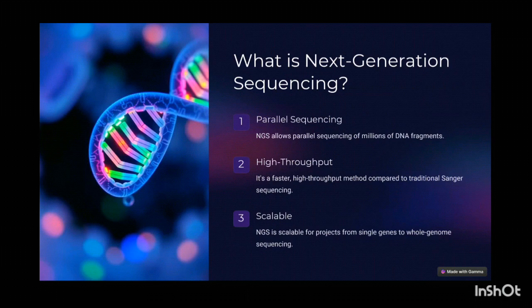This dramatically speeds up the process and allows you to finish the puzzle in a fraction of the time. The process of NGS starts with breaking down the DNA into smaller fragments. These fragments are then tagged with adapter sequences and amplified using polymerase chain reaction. The sequencer then reads the fragments, and bioinformatics pieces these sequences together, creating a continuous stretch of DNA. Think of this as using overlapping puzzle pieces to reconstruct the original image, so each piece attaches at the proper place where it is supposed to be.